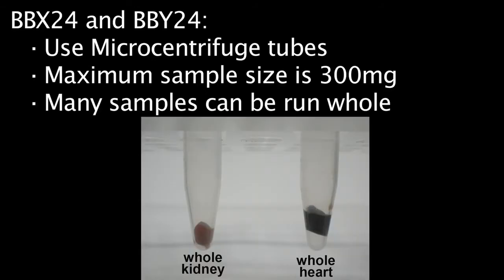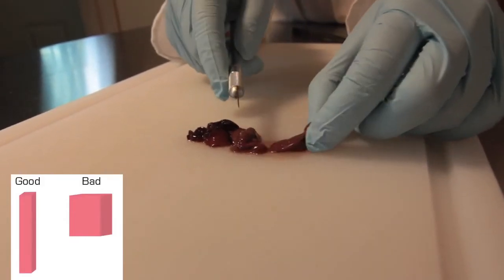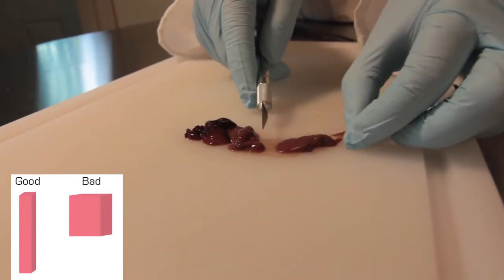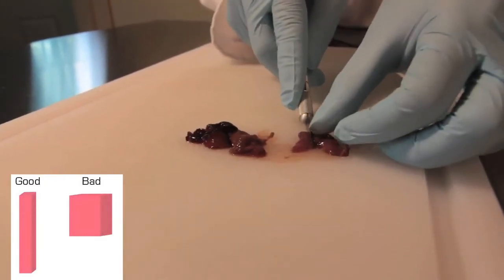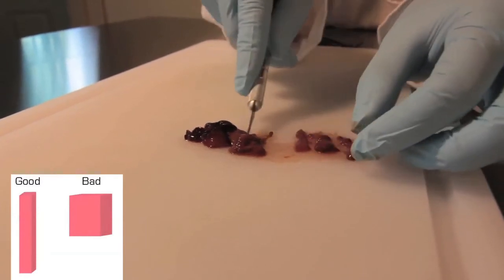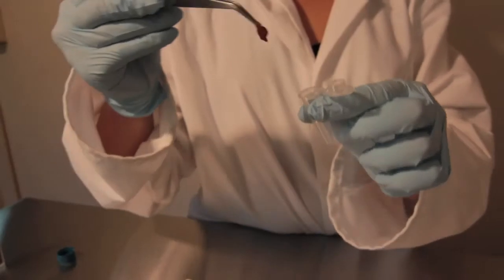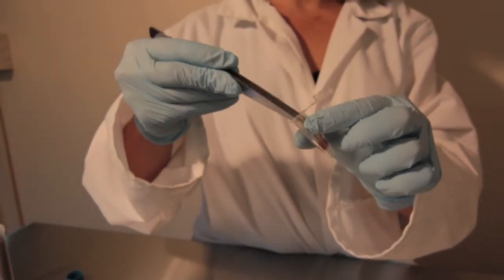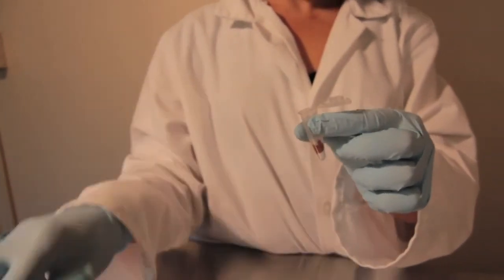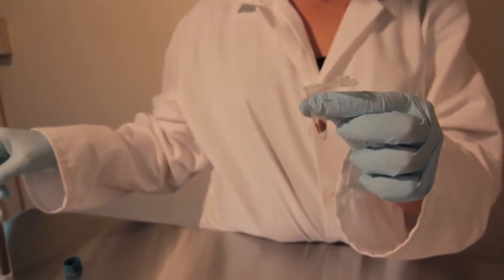Many samples, such as mouse organs, can be run whole inside of the instrument. Other samples, such as this mouse liver here, need to be cut up into smaller pieces. We recommend cutting samples into long, thin rectangles because this shape will homogenize more efficiently than cube-shaped or square samples. First, place the sample in the bottom of the tube. Don't stuff it down there because you want the tissue to be able to move around. This is essential for complete homogenization.